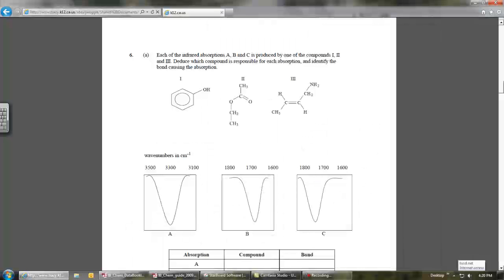So if we go back to this drawing, look at the compounds to choose from. Only one of them has that hydroxide group, like an alcohol. There it is right there. So this is probably a portion of the infrared printout for this compound, because it shows a peak where the hydroxide group of alcohol should be. Does that make sense? Go ahead, Devin.